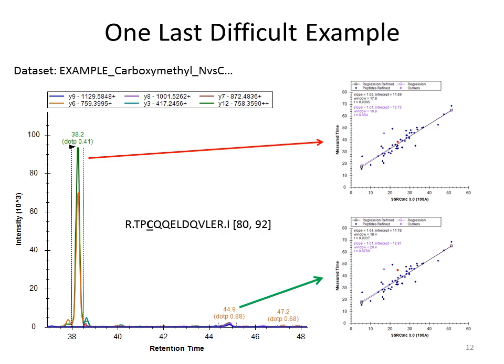I rarely see peptides coming from spectral libraries, or when I start a transition list, especially when I'm only targeting a few, I rarely see a total flat signal there. So again, this is why I look for something where there's no signal at the baseline. You just see that little thin baseline line from plotting. And over here, you don't see that. So I would have less confidence in this. And obviously the dot product would agree with me there. But the retention time may not be perfectly adhering to what we would hope.